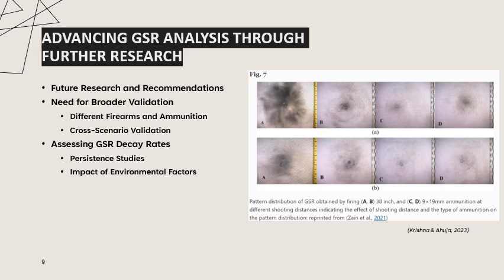You've got impact of environmental factors. These factors suggest researching how environmental conditions influence the decay or persistence of gunshot residue, which could critically affect the interpretation of time since discharge in forensic investigations.